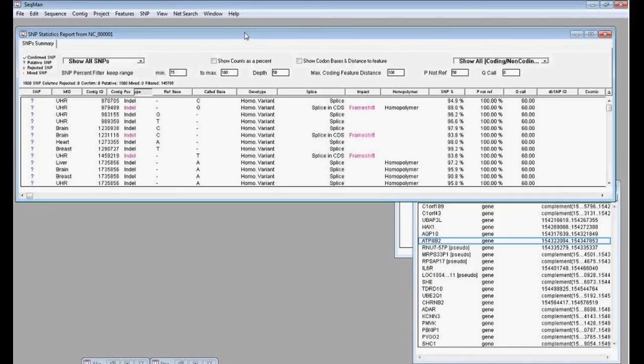A lot of the sequences you can download from NCBI have annotations for some of the more common SNPs, and those would appear in the list as well. But if you don't have any, you can create your own annotated reference sequence using some of the tools that we have in our software. And for more specific details, we can set up another webinar or answer emails and show you how to do that.